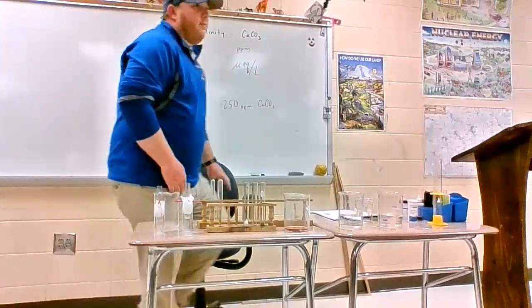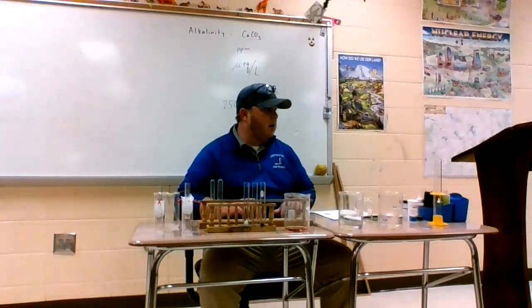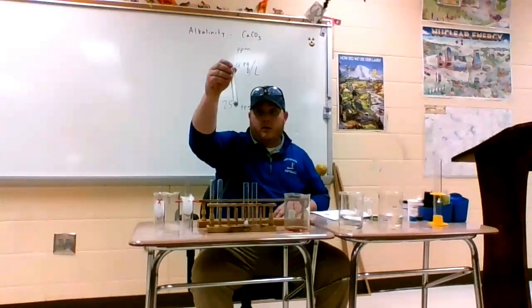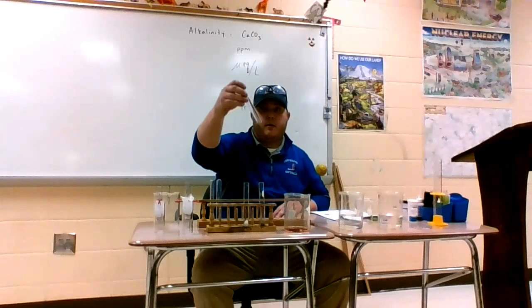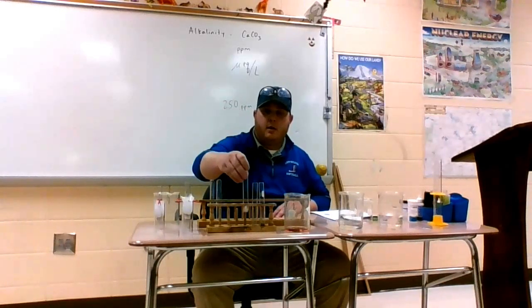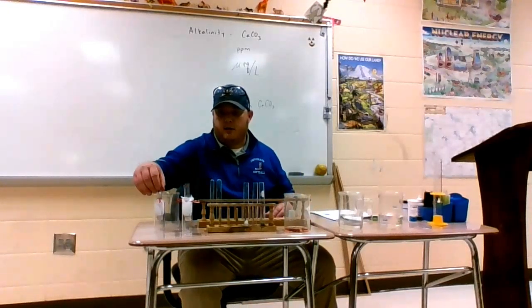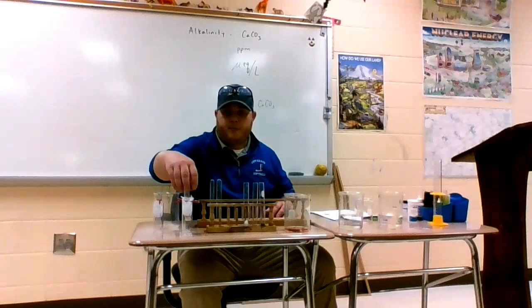I'm going to do this a little bit differently because it says to use the test strips to indicate the pH. I have one with basalt, one with granite, and one with marble chips. And then I've made 3 soil samples. There's sand, there's humus, and here's clay.